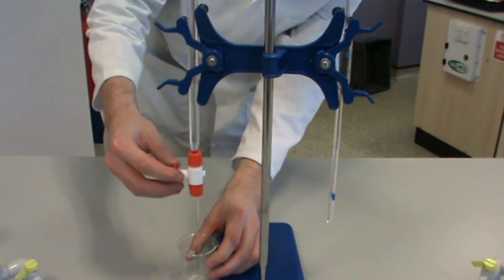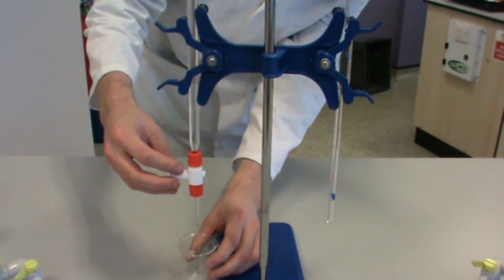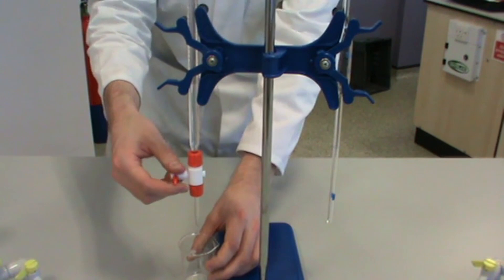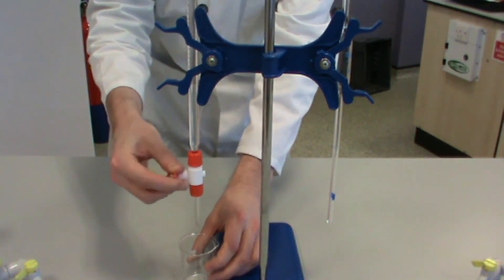Open the tap on your burette and allow a small amount of acid to fill the burette below the tap. This will help you gain an accurate measure of the volume of acid used.